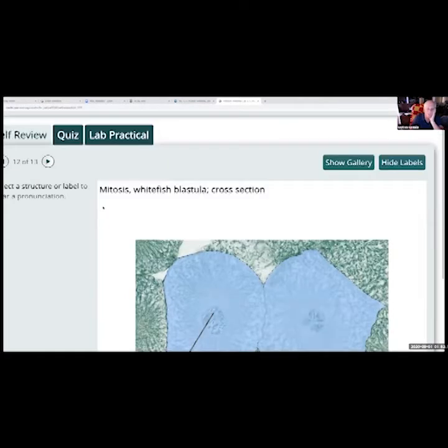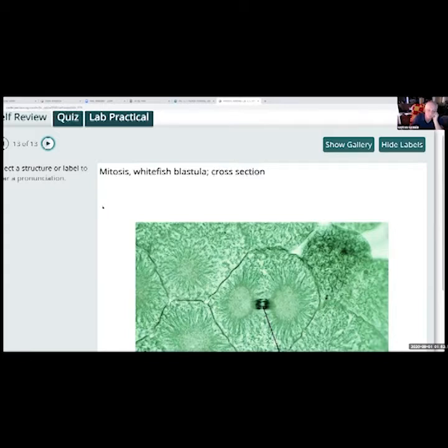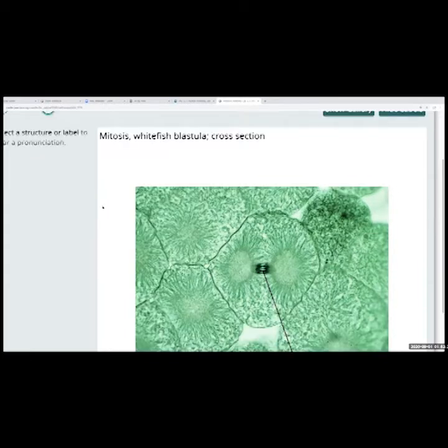Last one. What is that? Anaphase. Anaphase, being pulled apart. And all the other cells are in interphase. I don't see anything else even condensing. Okay, that was the cells on that.